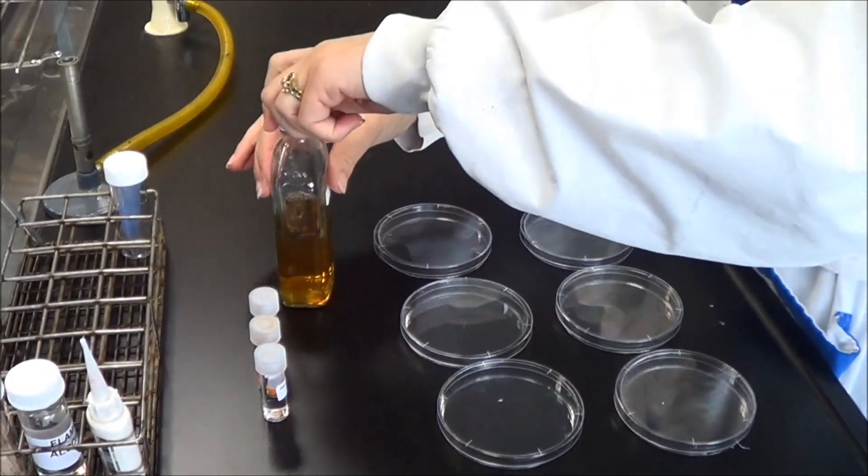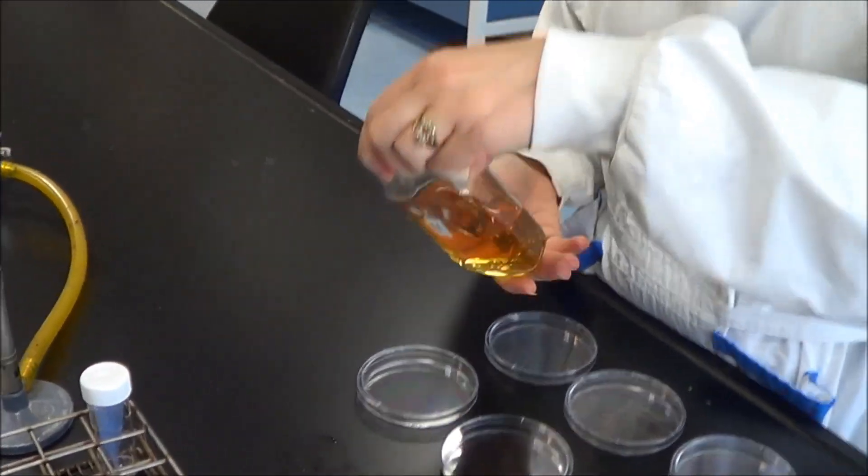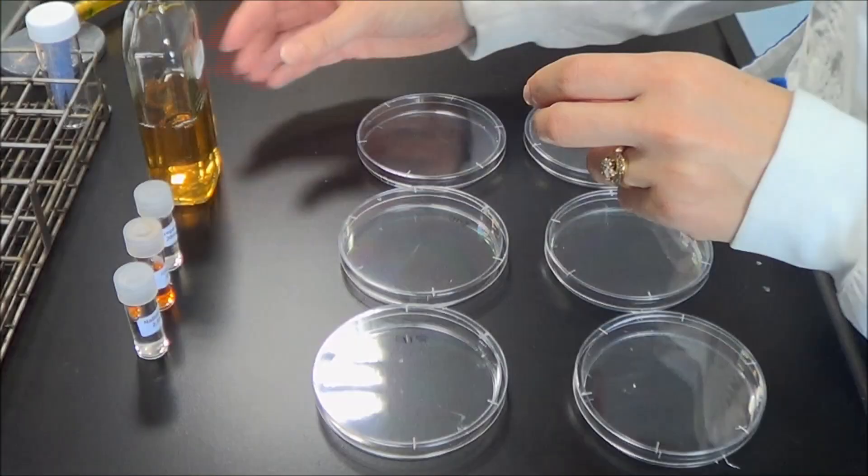Rotate the bottle to mix. Don't shake the bottle or you will introduce bubbles into your agar.